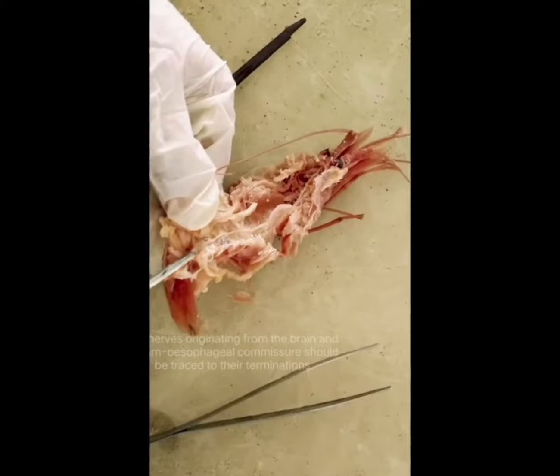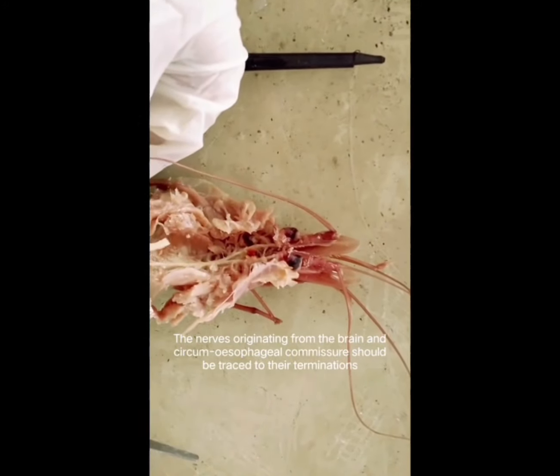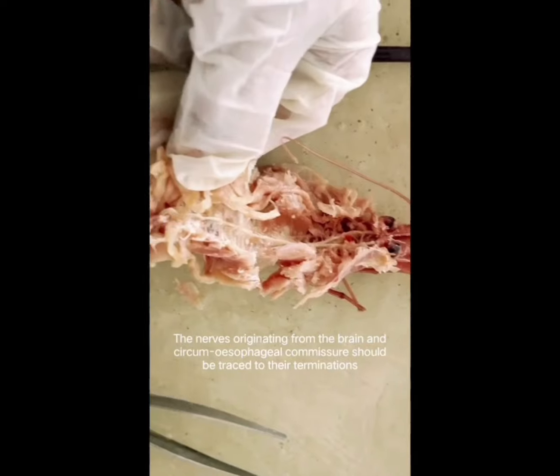Now we are going to proceed with the dissection. Our brain is going to originate the nerve, and we can see the circumoesophageal commissure clearly.